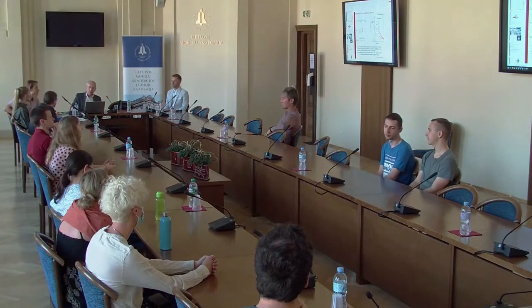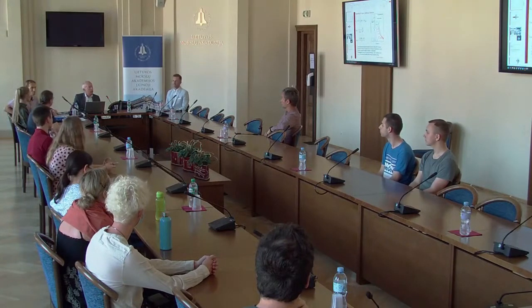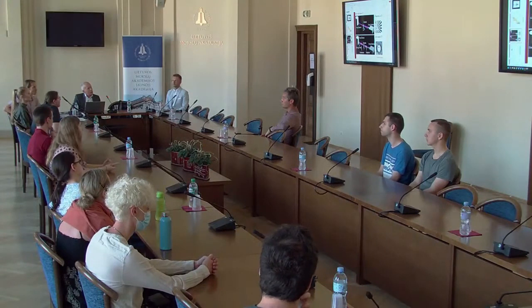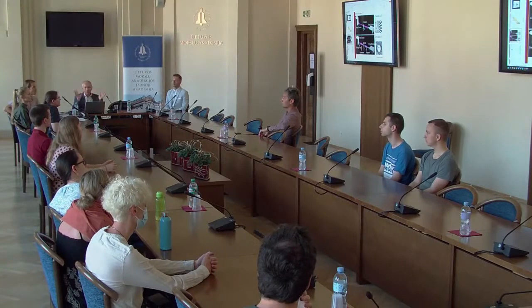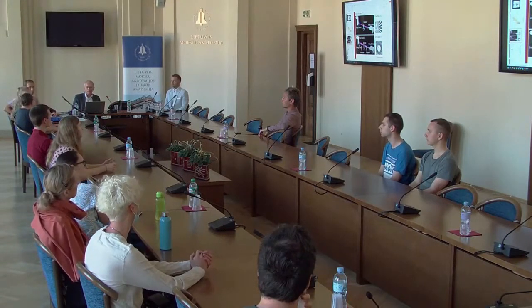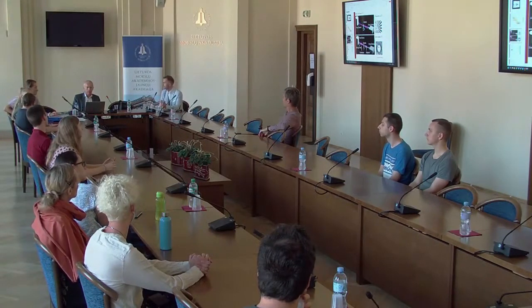Nano-CT, čia būtų nano. Tai būtent tai. Didesnis ko gero, taip, jo. Taip, va čia būtent ir rodo, kad kai turi nano-CT, tu gali išskirti 50 nanometrų linijas. Tuo metu micro-CT mes galim išskirti vieno mikrono, o šitas atrodytų kaip kažkoks išplaukęs vaizdas, nieko daugiau nesimato. Mes planuojam nano-CT irgi įsigyti kažkuriuo metu.